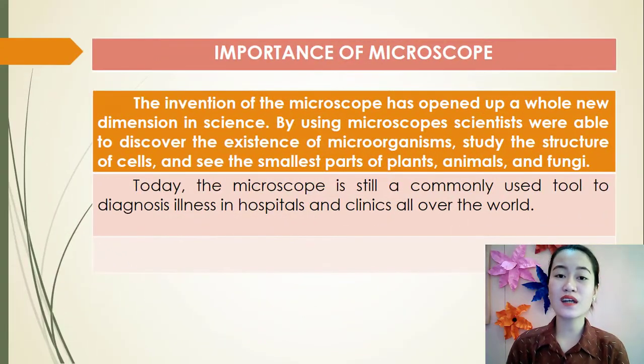So next, class, what is the importance of the microscope? The invention of the microscope has opened up a whole new dimension in science. By using microscopes, scientists were able to discover the existence of microorganisms, study the structure of cells, and see the smallest parts of plants, animals, and fungi. Today the microscope is still a commonly used tool to diagnose illness in hospitals and clinics all over the world. So that is the importance of the microscope.